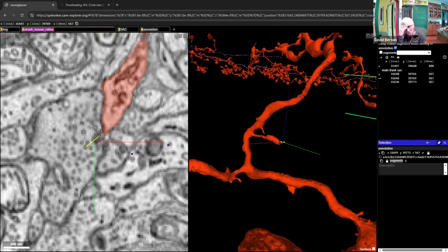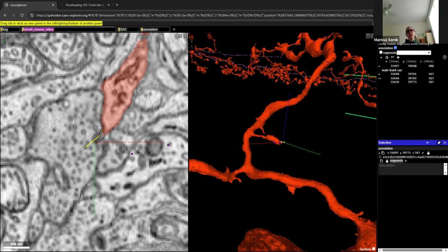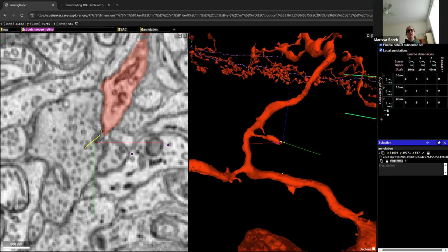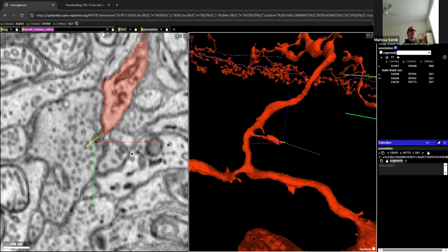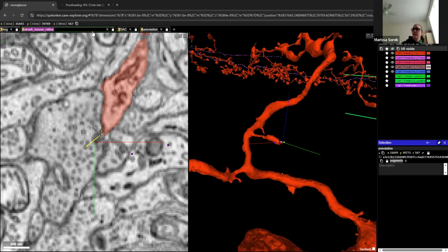You can also export these out if you want, as CSVs, I believe. So that is possible, so you don't lose those lists. But this is something for you. And you had a question, and I apologize.